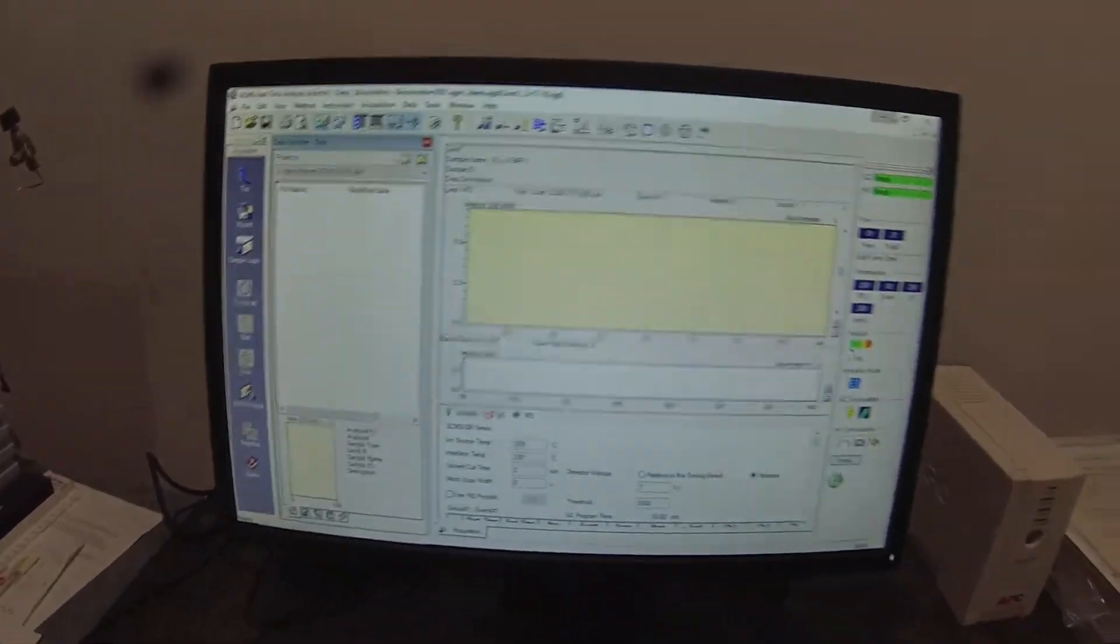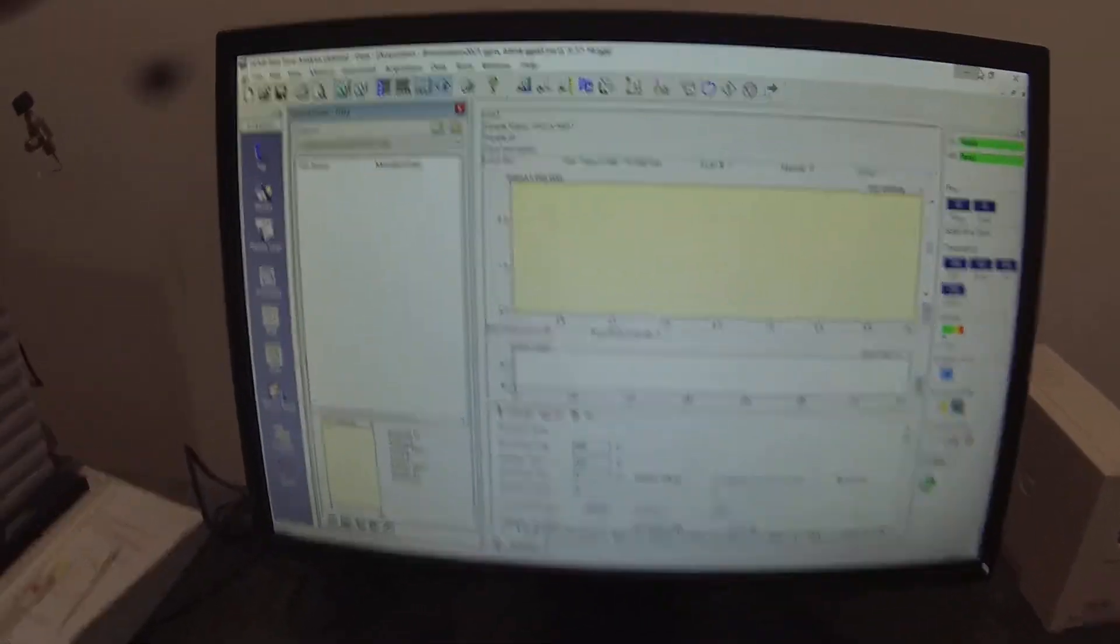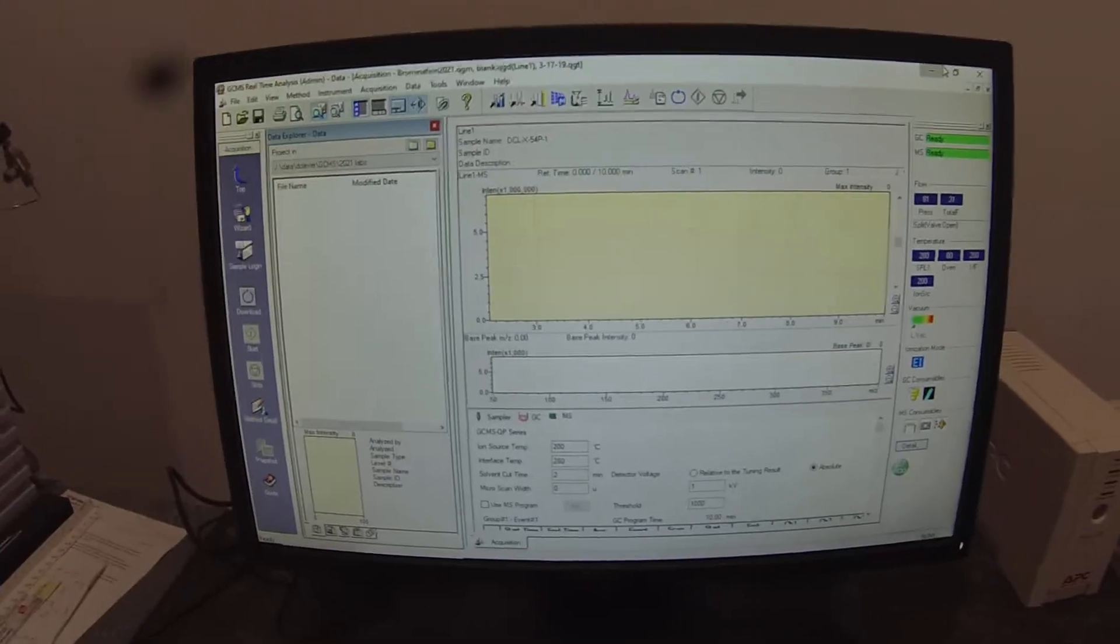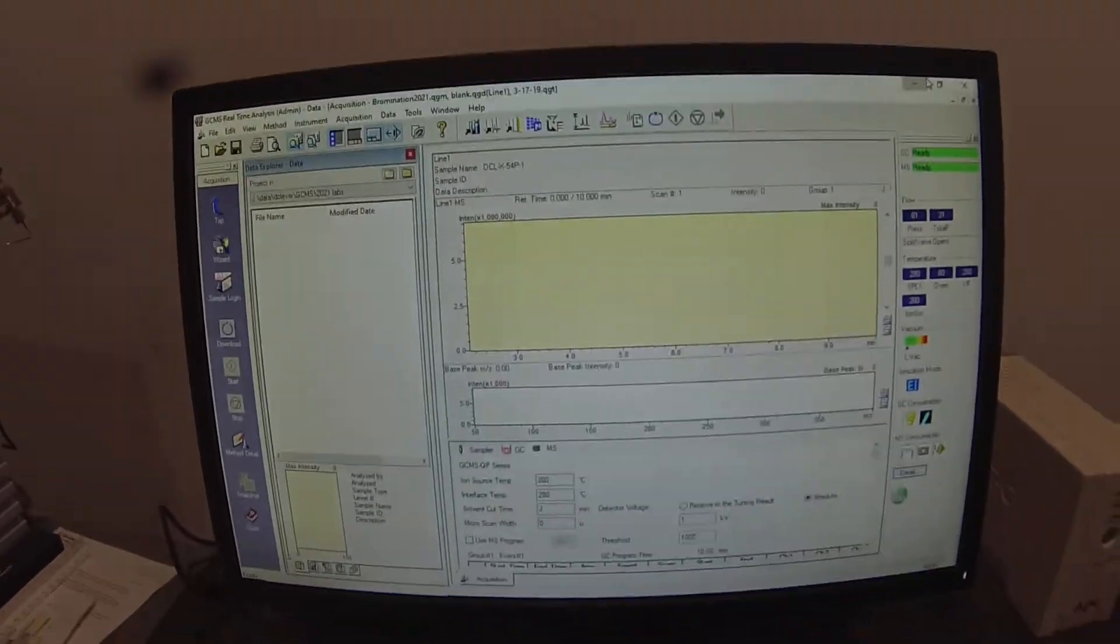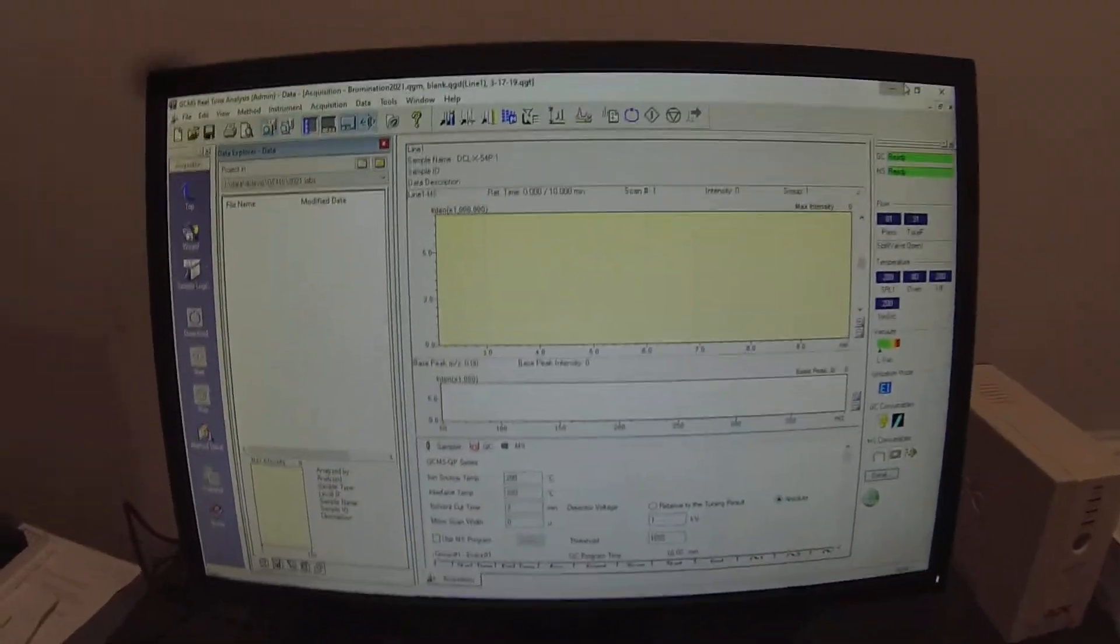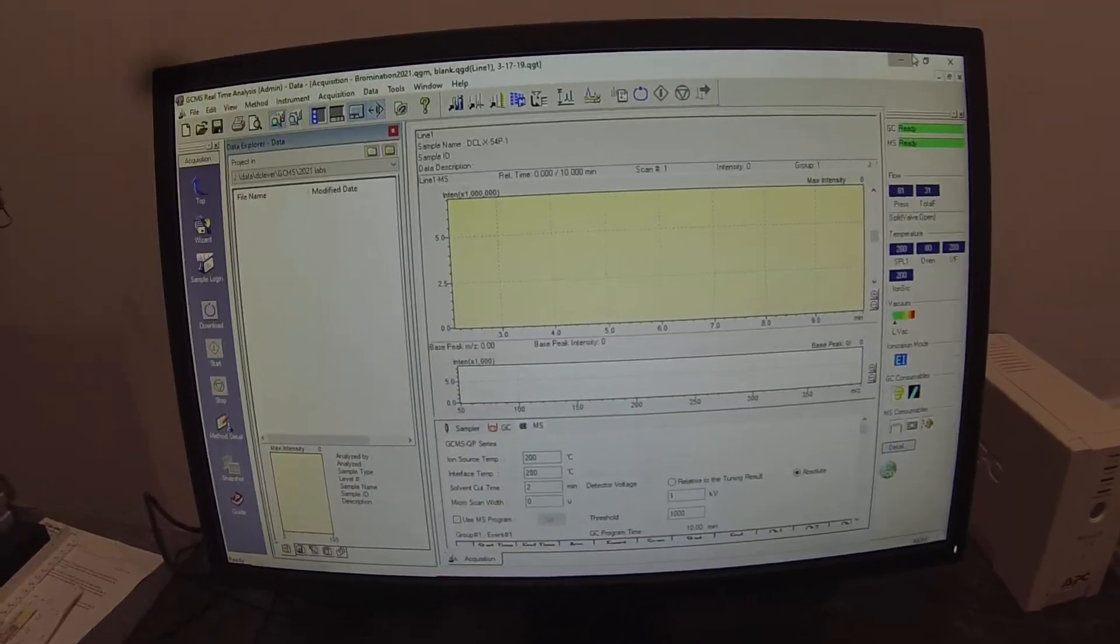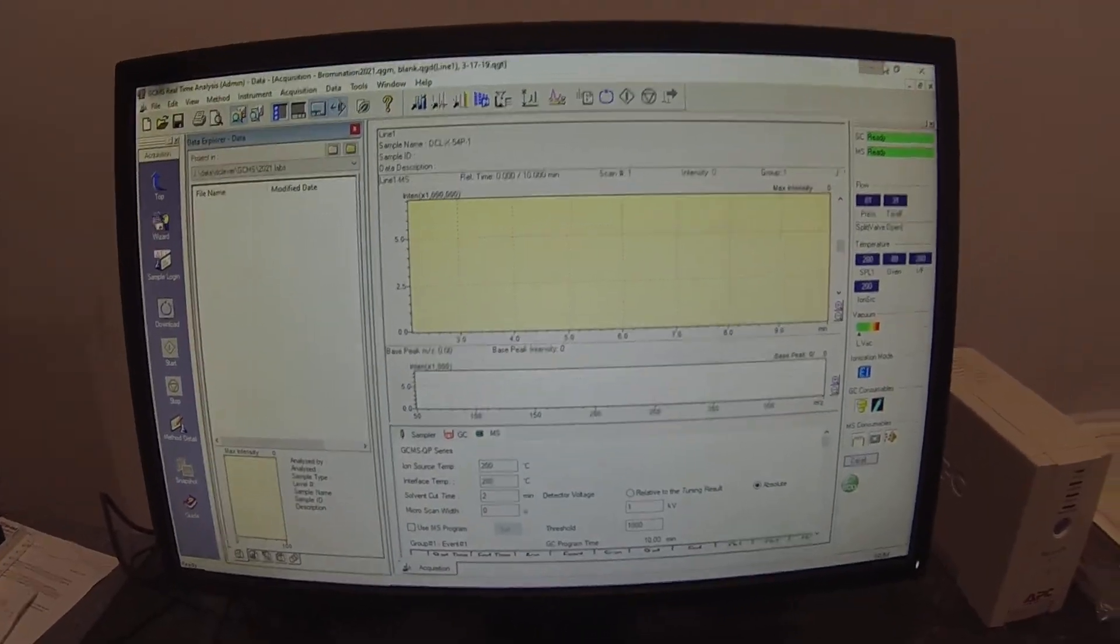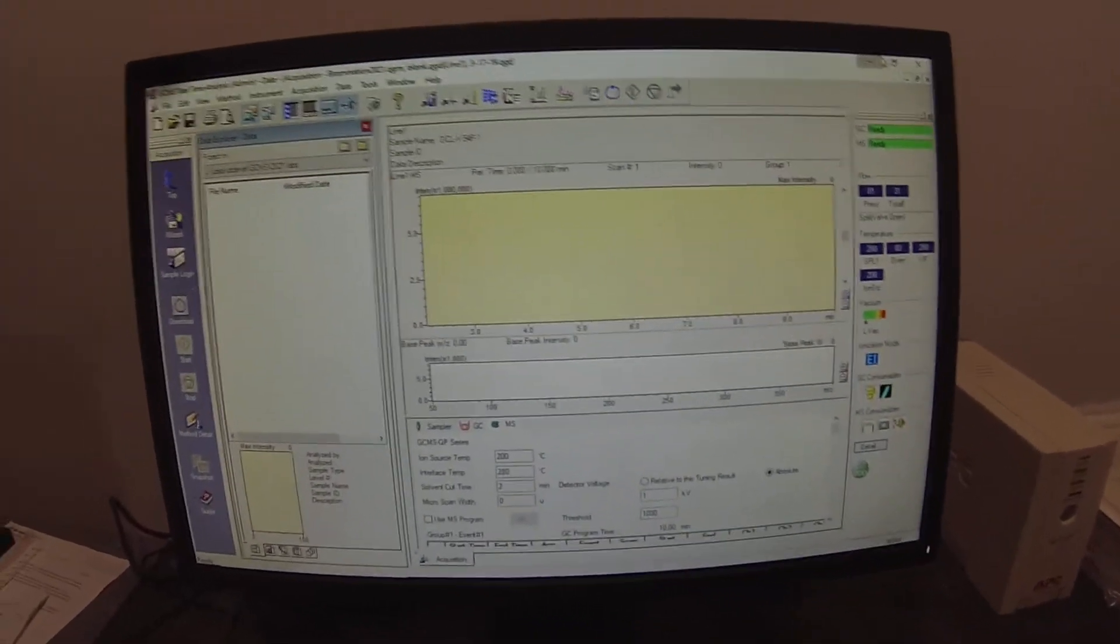And now we need to sit at the instrument and set up our analysis. So I will change the camera angle. I'm just hopefully pointing at the screen. You can see what I'm doing.